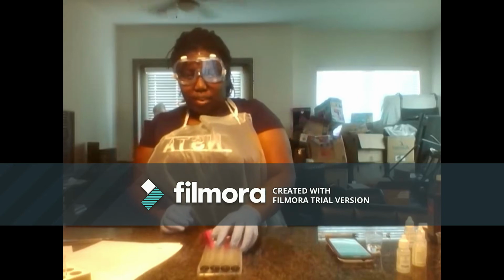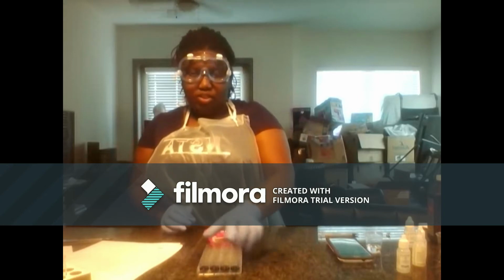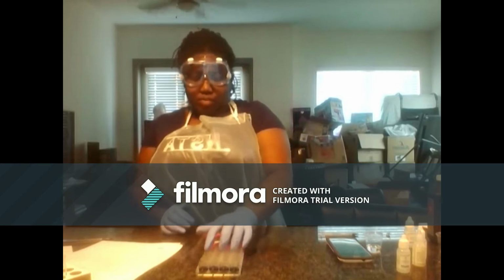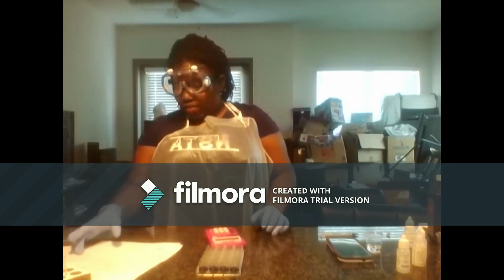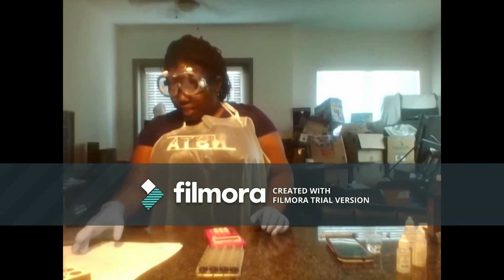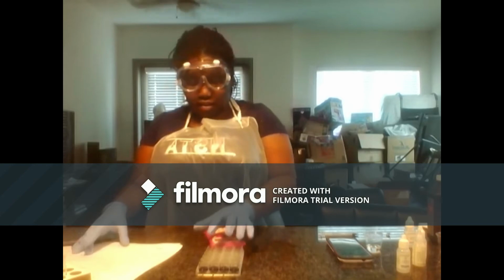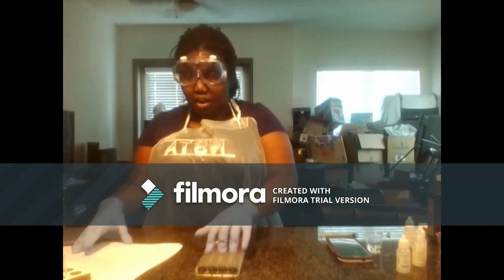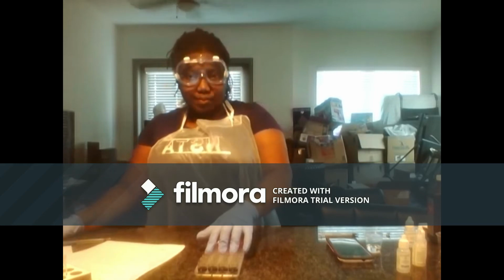Alright, so I completed my trials 5 and my trial 6. Gave them 2 times each so I could have an average. And so I'm just going to move a little further down on the well plate to do activities 2, trial 7 and 8, which are the same concentrations as well. So I'll do one on camera and then I'll come back and show you my completed 4. And then we'll move on to activity 3.